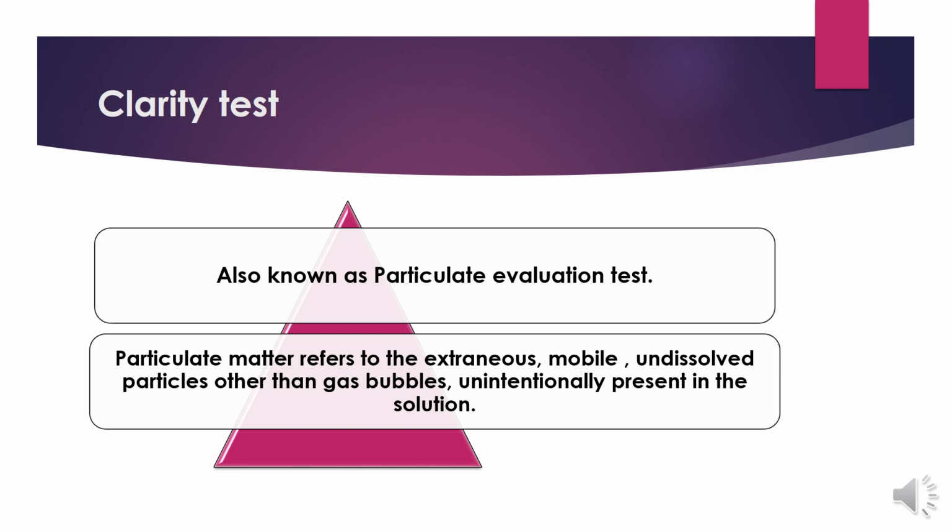So these matters shouldn't be present. To check the presence or absence of such material, we need to perform this clarity test or particulate evaluation test.